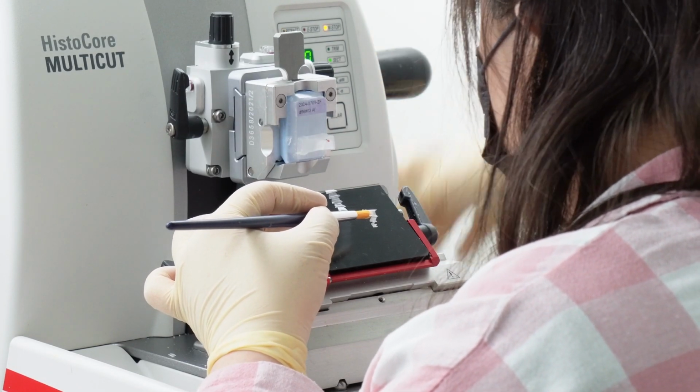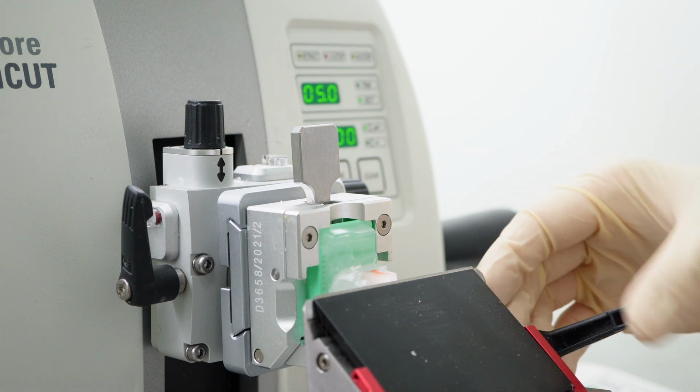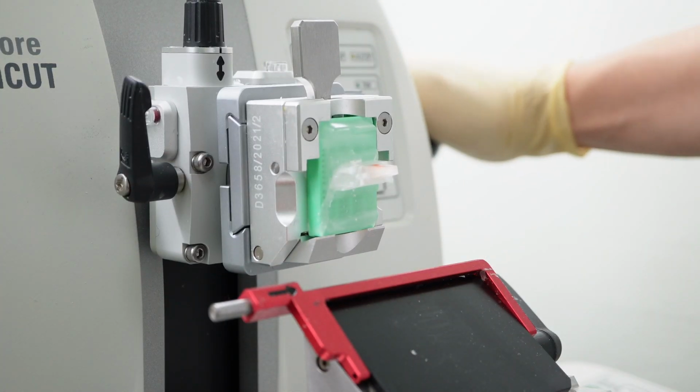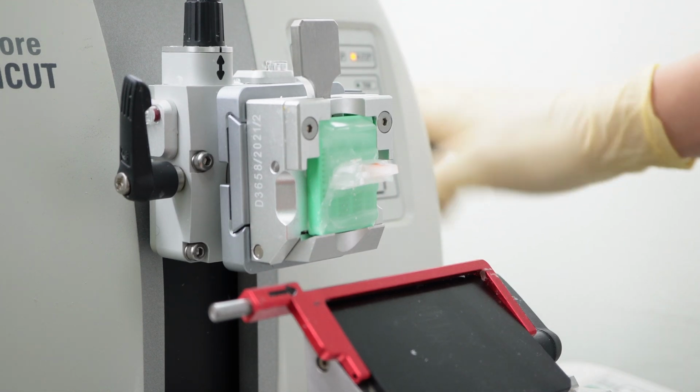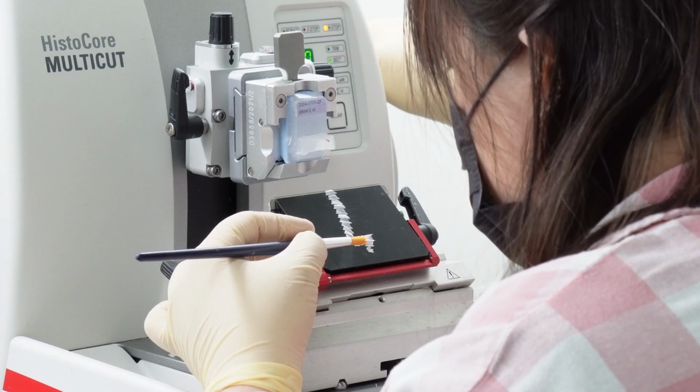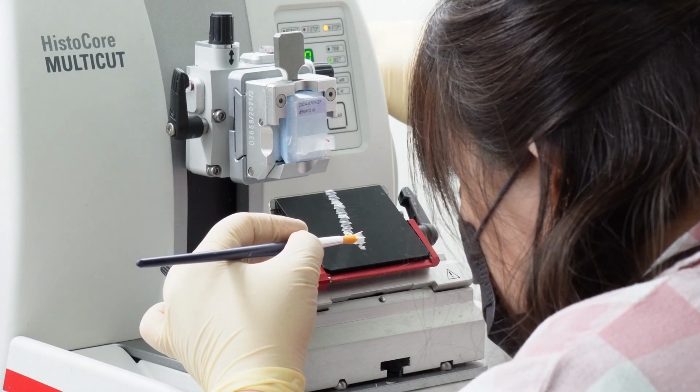And always, always double-check the safety guards and mechanisms before you even touch it. It's powerful and potentially dangerous if you're not careful and well-trained. Got it. Respect the blade. Expertise and caution are key. What kind of environment is best for actually doing the sectioning?